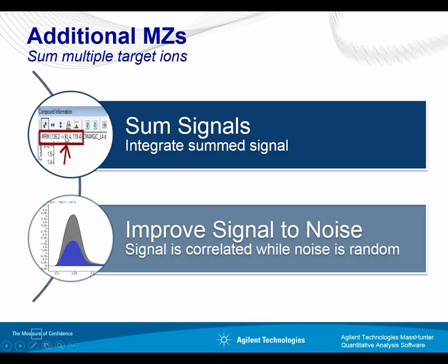And if you look at this notation here, I've got several product ions that I'm going to sum up. They come from the same precursor ion, and I'm going to integrate those signals together into a summed signal.